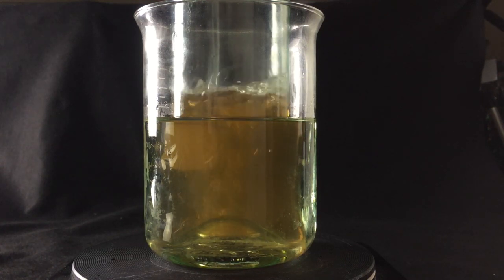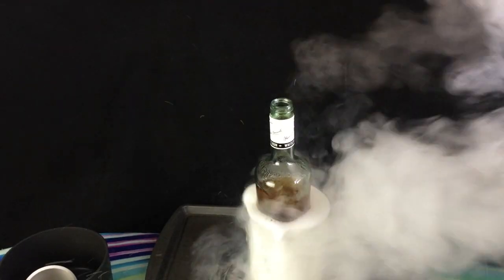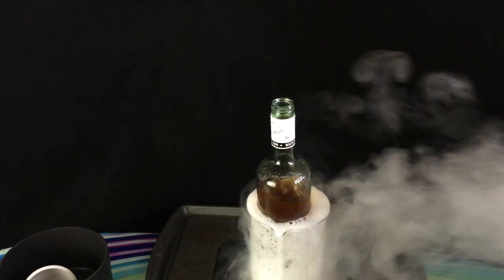Make sure that the top of the liquid is always well below the neck of the bottle. And finally, it's a good idea to set your hot plate next to a window fan, just in case. It's proved pretty convenient to me on more than one occasion.